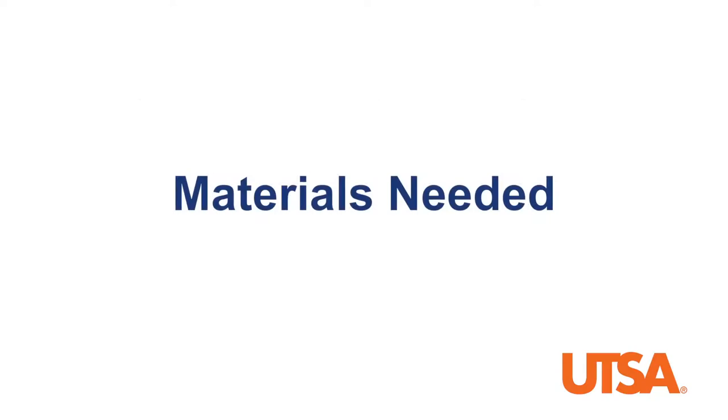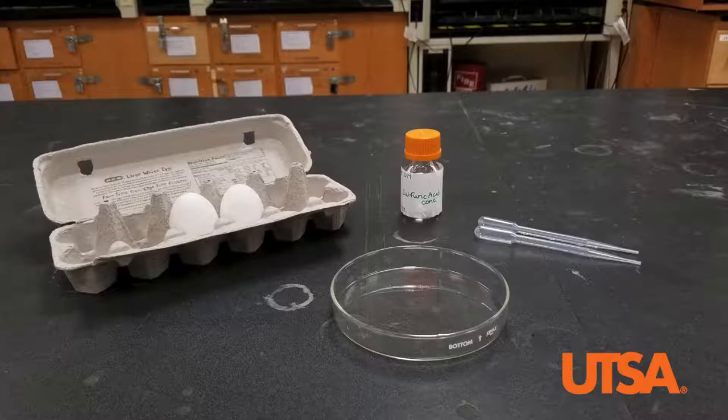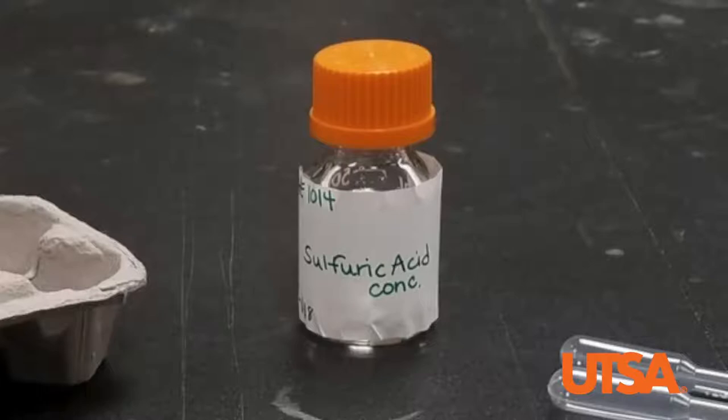Let's look at the materials we will need for each demonstration. For the egg demonstration, you will need a petri dish, an egg, a pipette, and a strong acid. I will be using concentrated sulfuric acid.